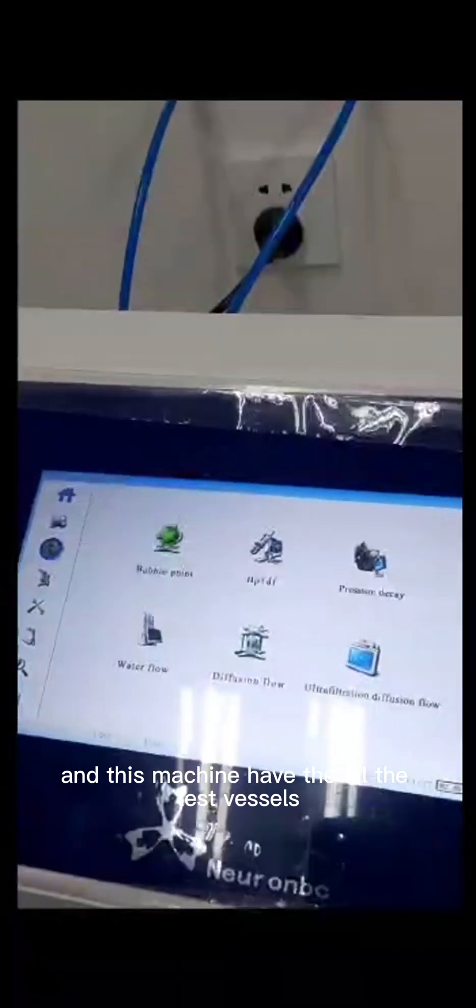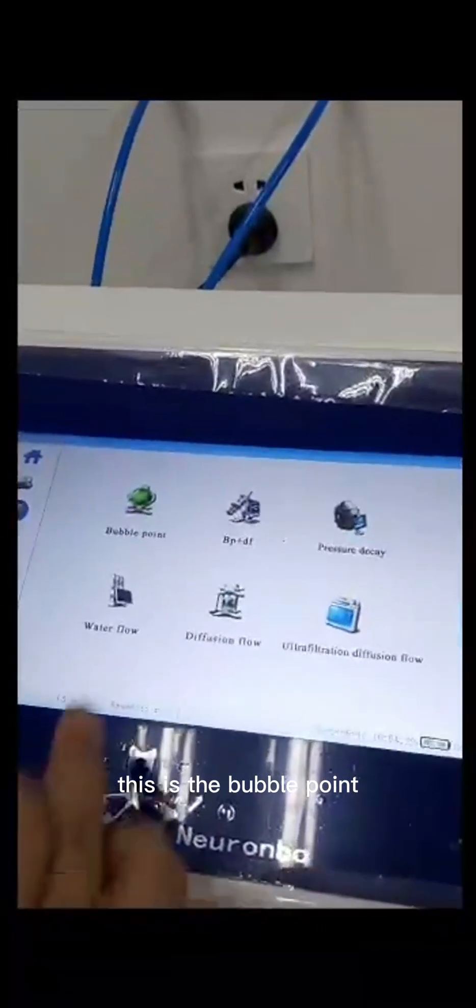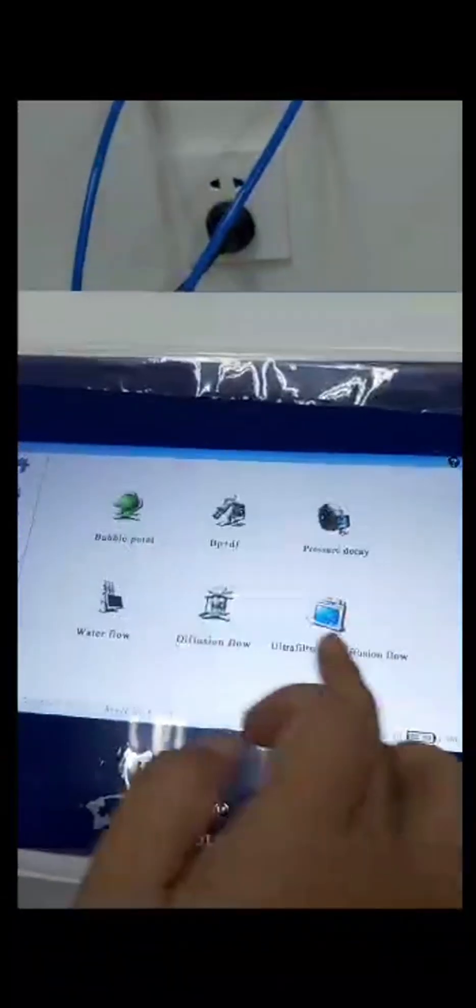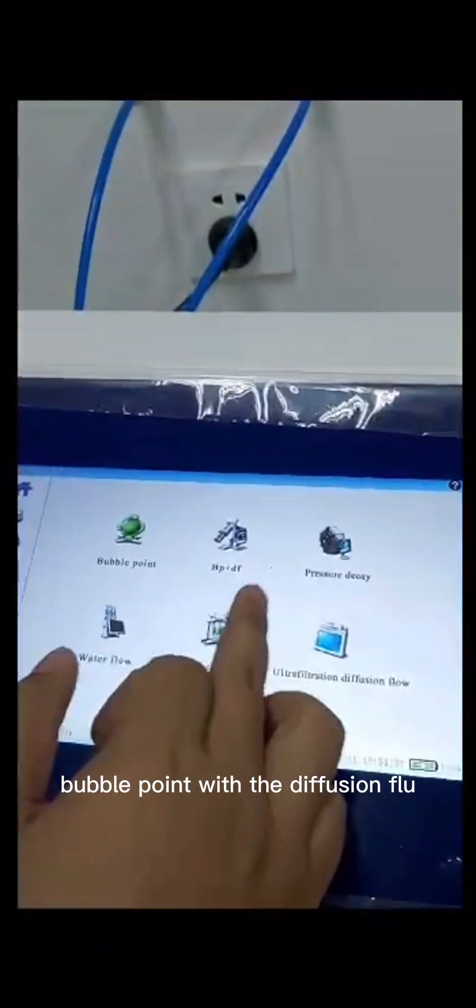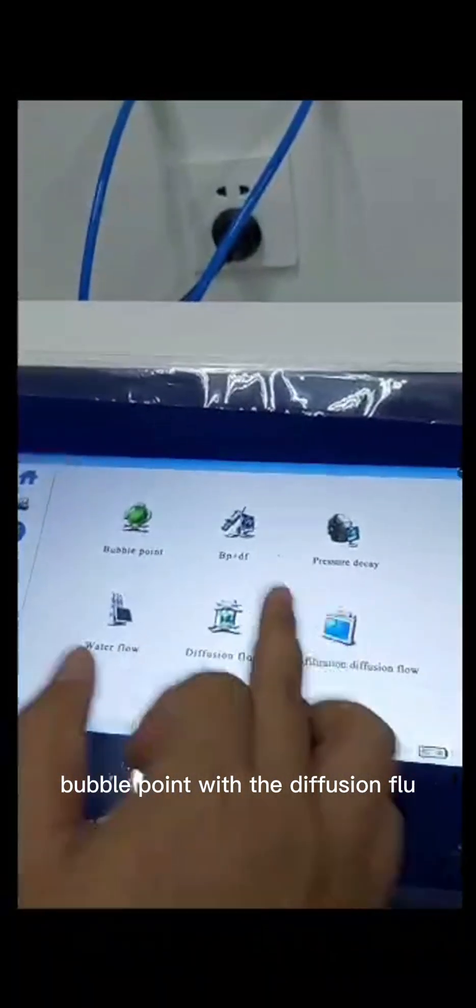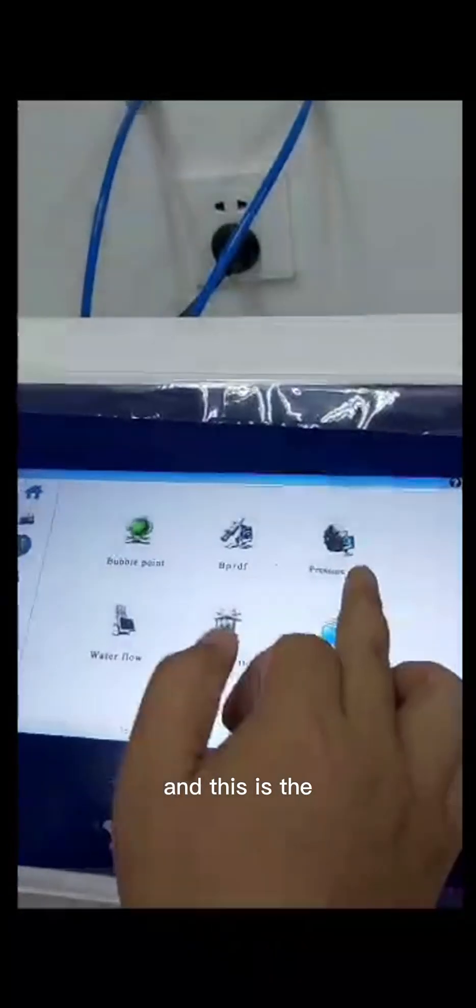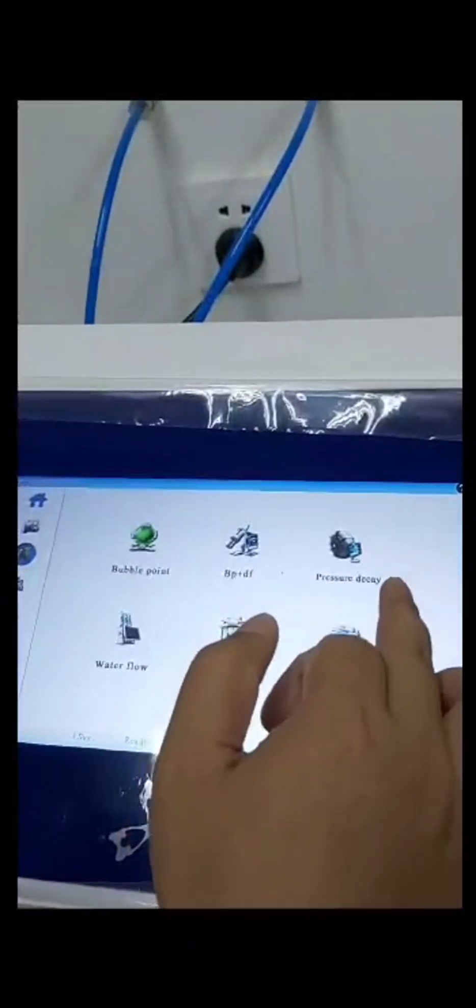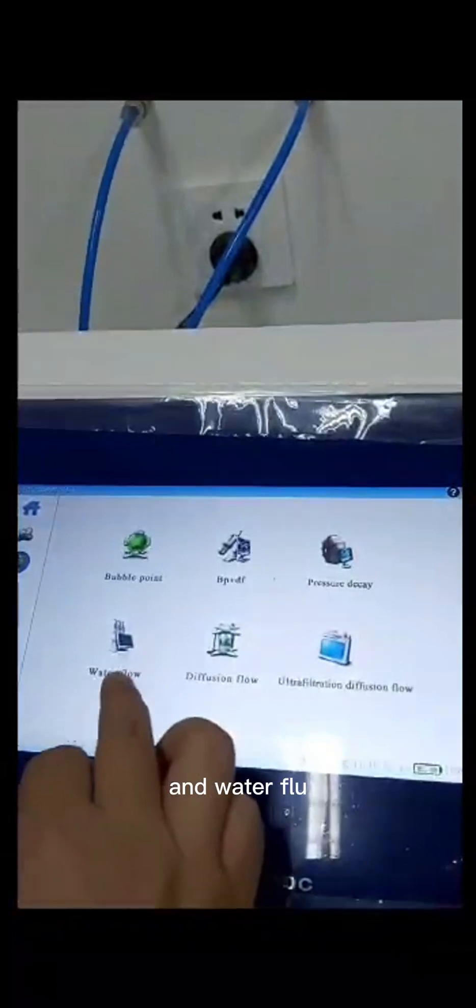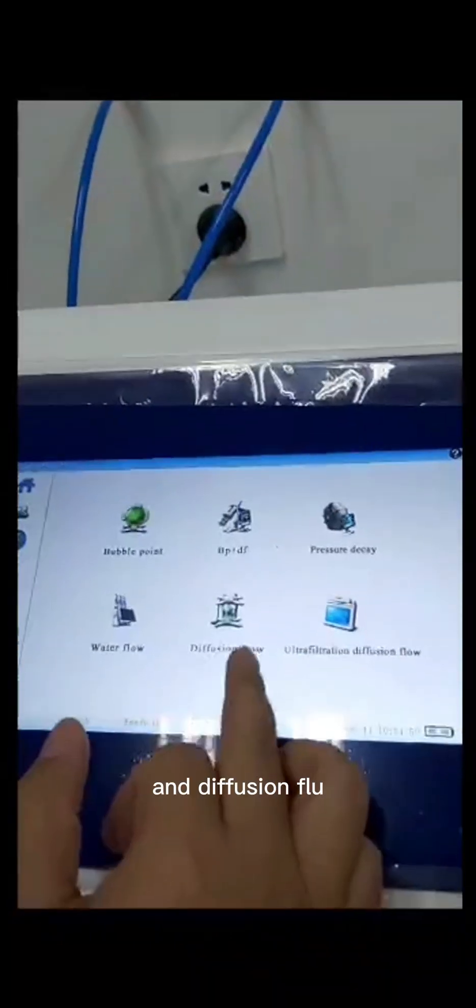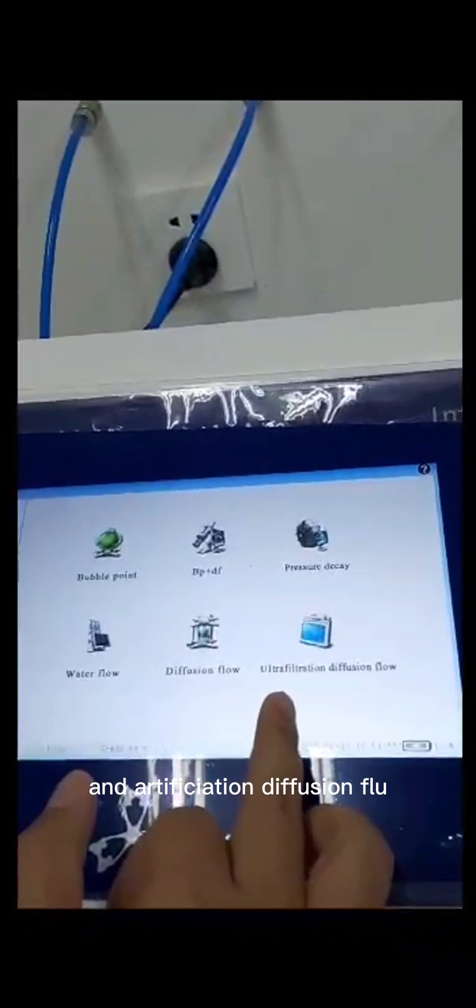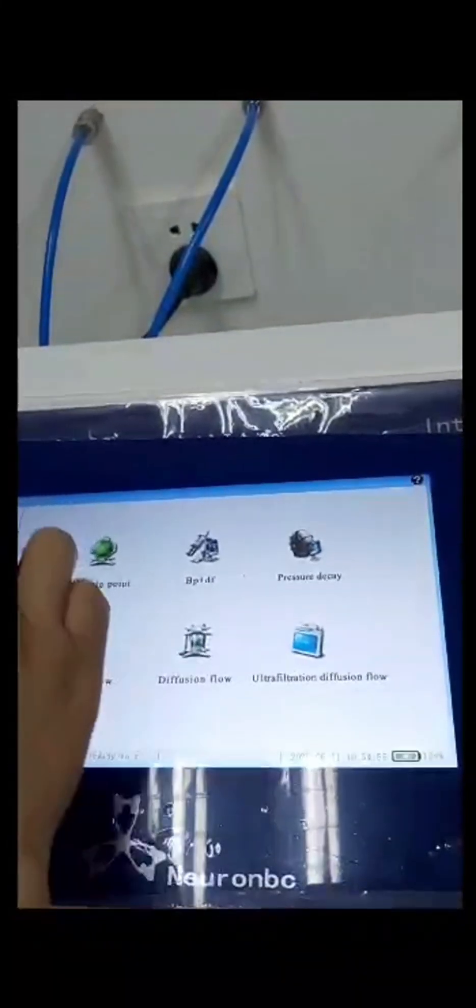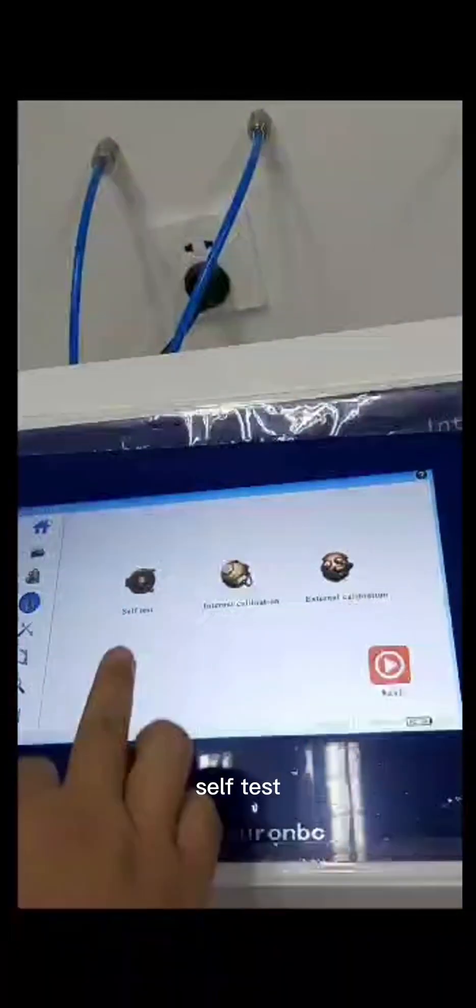This is the test. And this machine has all the test methods. This is the bubble point, and this is the bubble point with the diffusion flow. And this is the pressure decay, and water flow, and diffusion flow, and ultrafiltration diffusion flow.